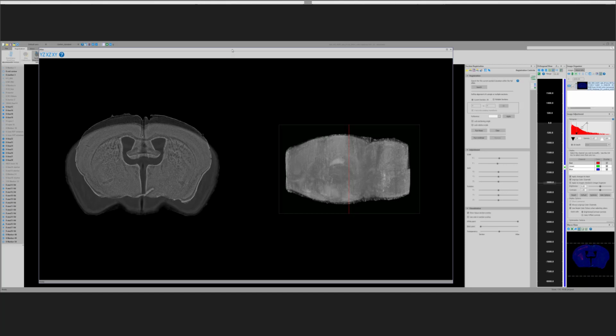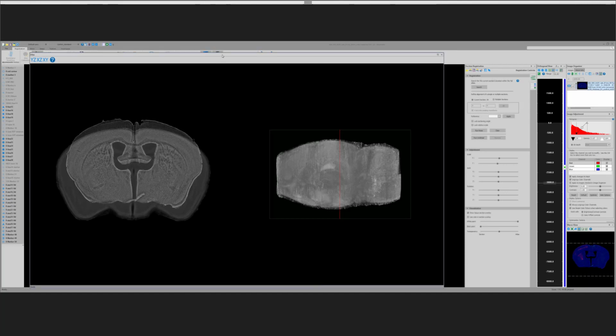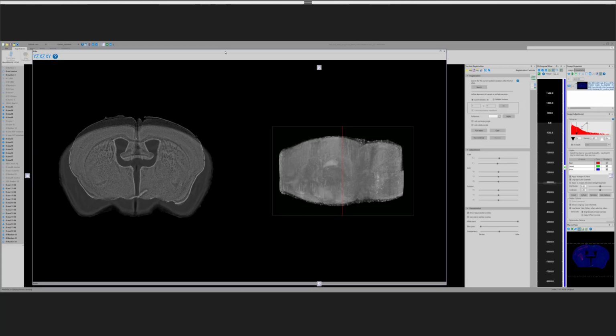So this is a window. If I could just jump in there, Chip, just to say, we also do support cross-modality registration. So if your modality doesn't exactly match the reference image in the atlas, we can still do the registration. But in this case, because we have a modality that matches what you use in your lab, it's a good reference to use for doing the registration.